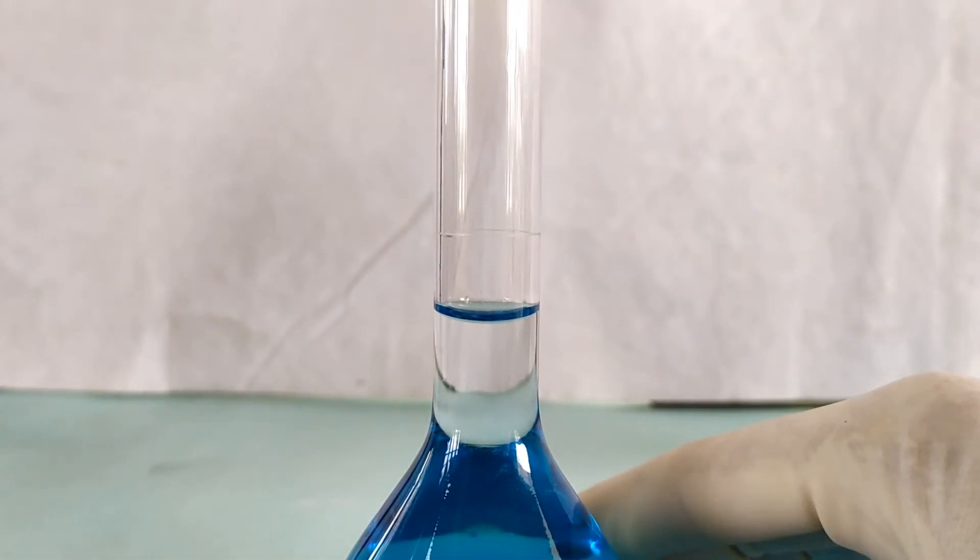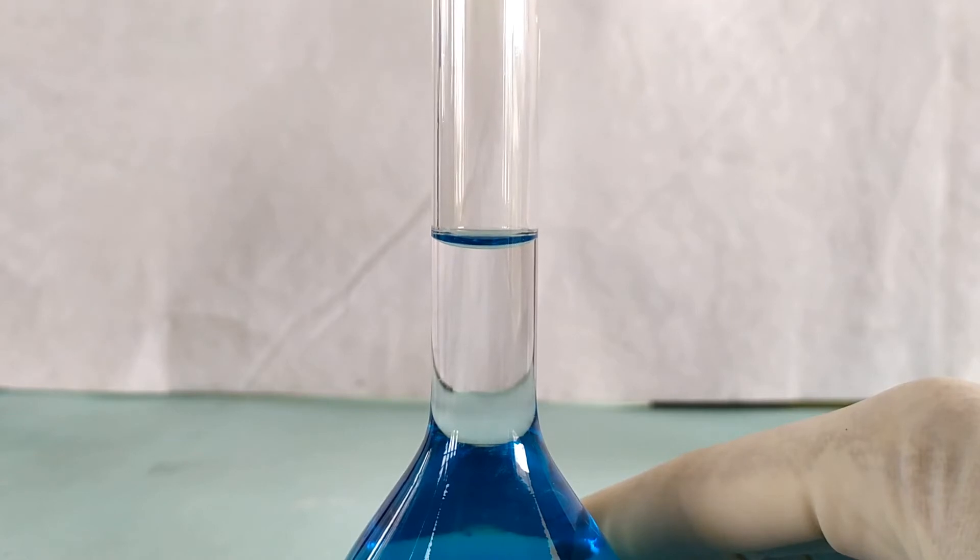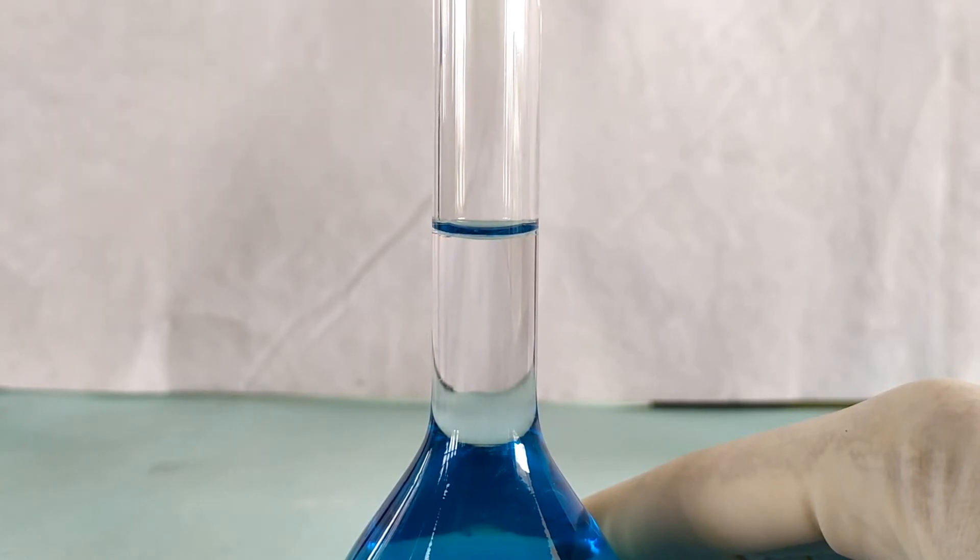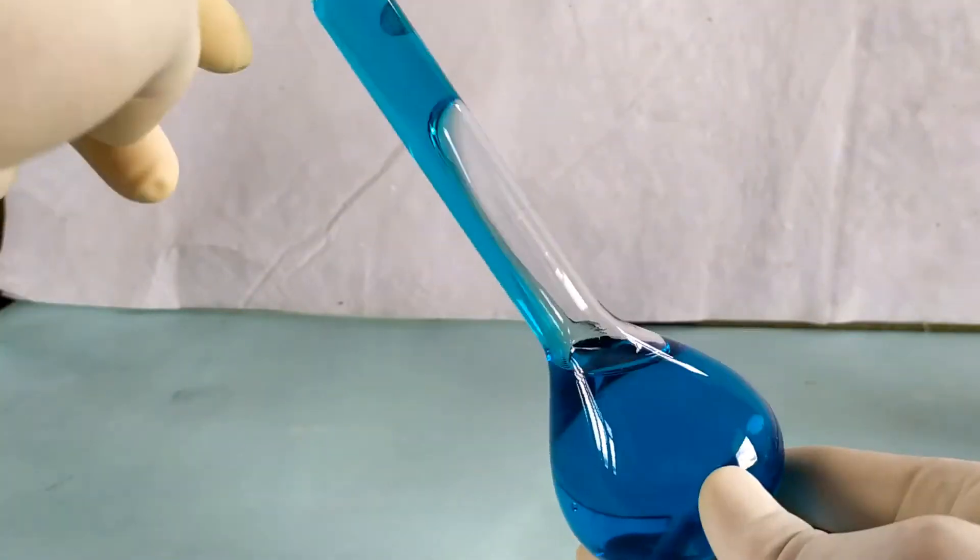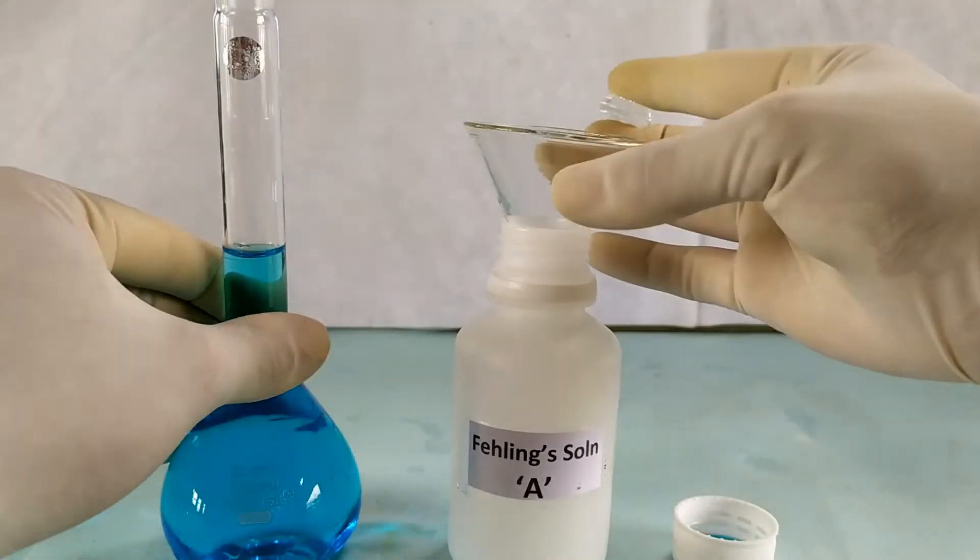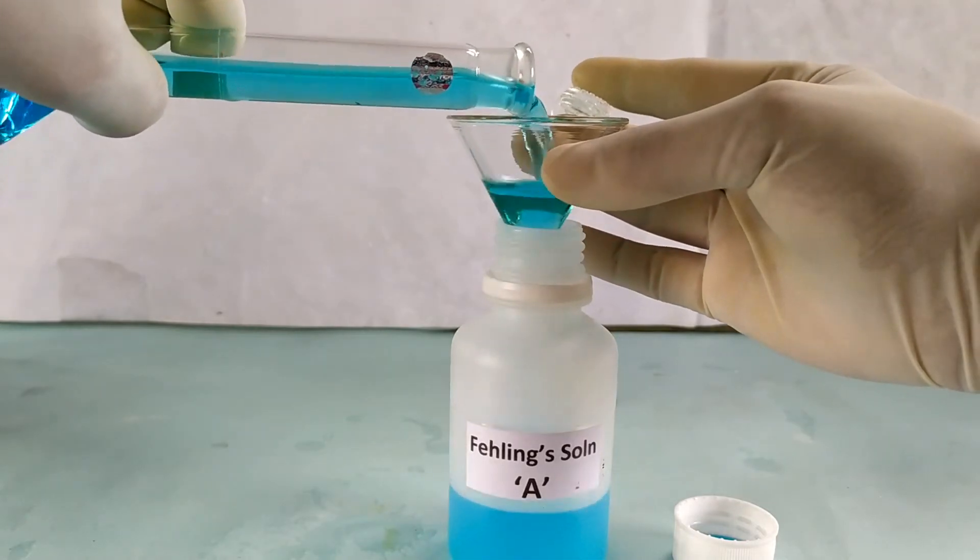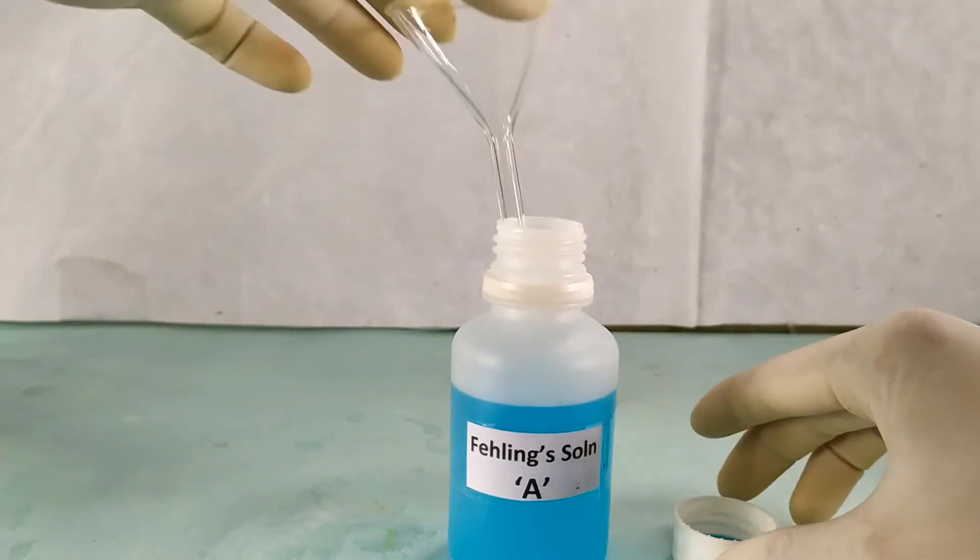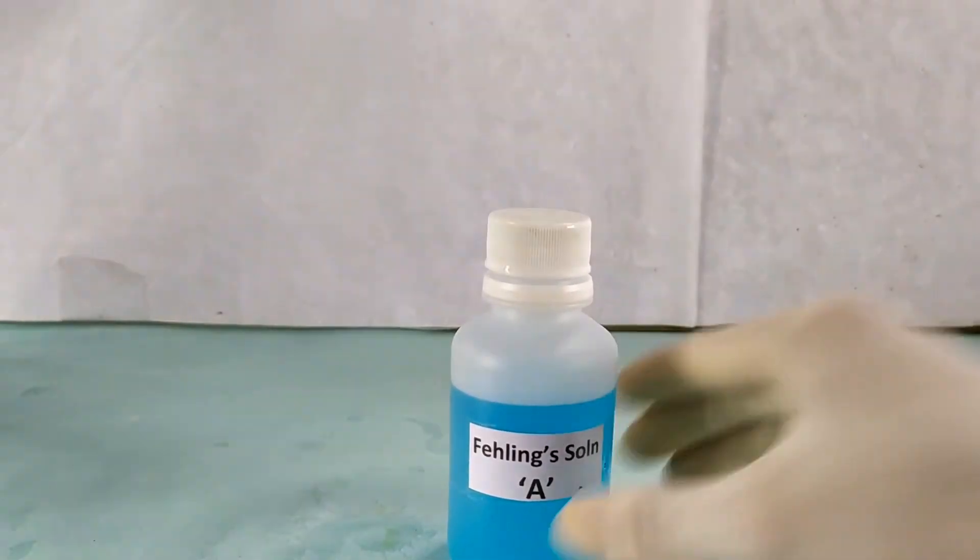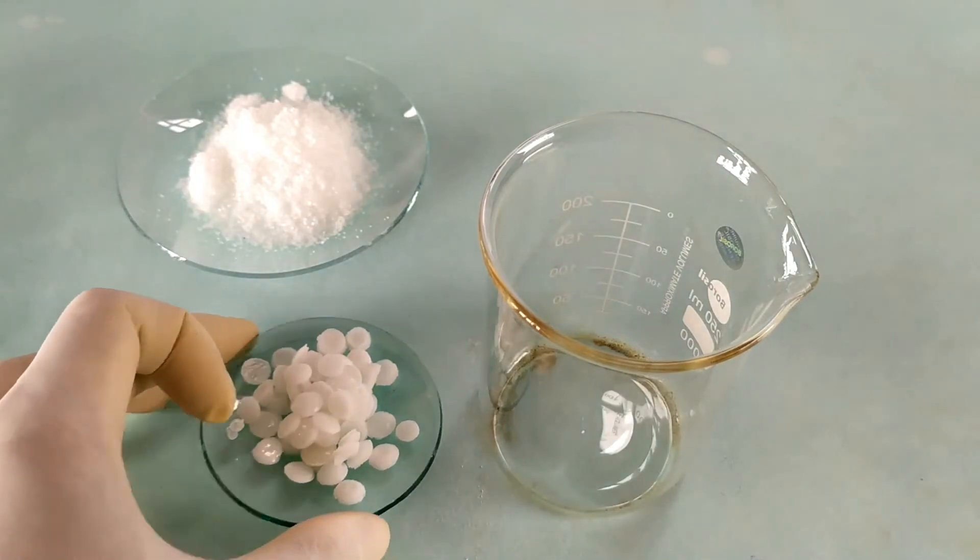Make up the final volume in the flask to 100 ml with distilled water using a dropper or pipette. Stopper the flask and mix the contents well by inverting the flask a few times. Transfer the solution into a container with a tight-fitting cap and label it as Fehling's solution-A. Keep the container aside and proceed with the preparation of Fehling's reagent-B.